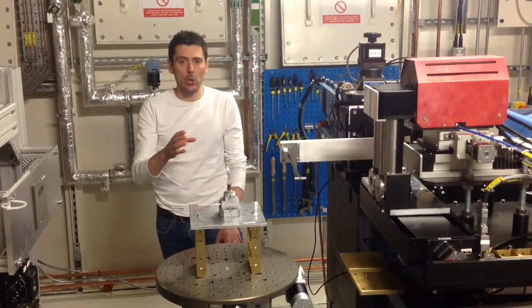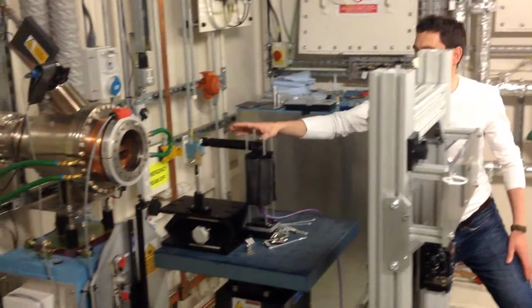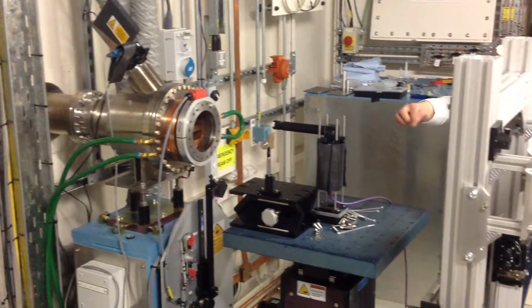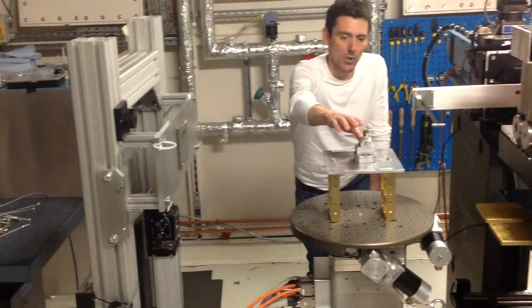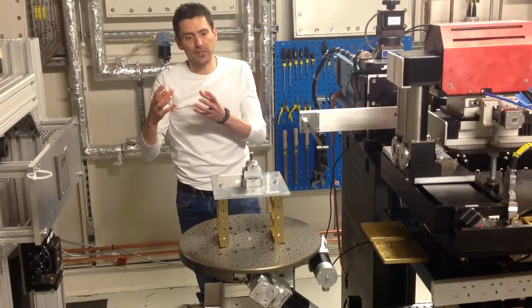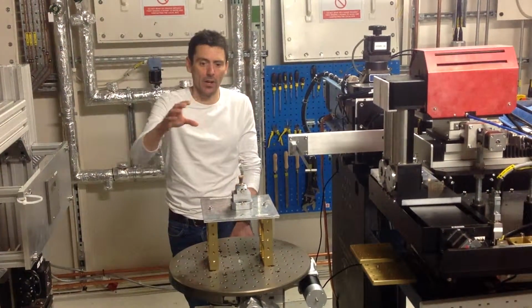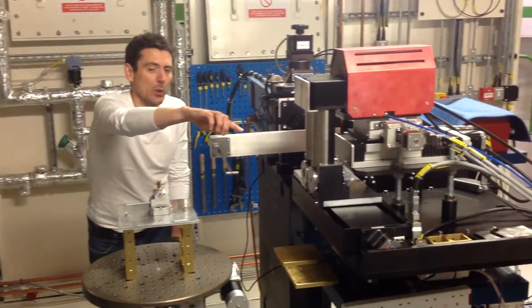And what I can show you a little bit is, if you turn the camera over here, this is where the high energy beam comes from the synchrotron light source into the experimental hutch. And the X-ray beam passes through here and goes through our soil sample, which is positioned here. And then the various density within the soil sample produces differential absorption within the X-ray beam that passes through the sample and goes into a camera.